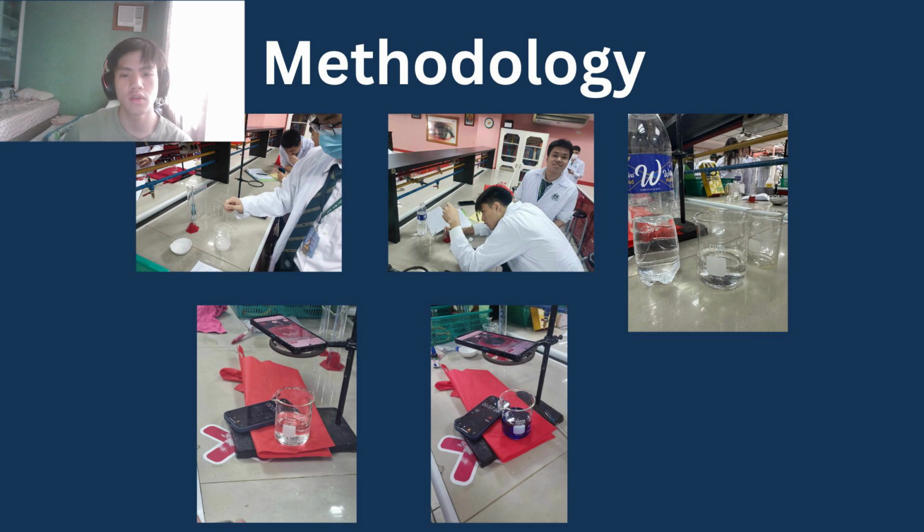Initially, we need to determine the amount of sodium carbonate required to be added to the water to create a 100 milliliter solution with a concentration of 1 molar of sodium carbonate. To achieve this, it is crucial to understand that the formula for 1 molar concentration is 1 M equals 1 mole per liter. Given that the desired solution is 100 milliliters, which is equivalent to 0.1 liter, the amount of moles in grams of sodium carbonate should be divided by 10.